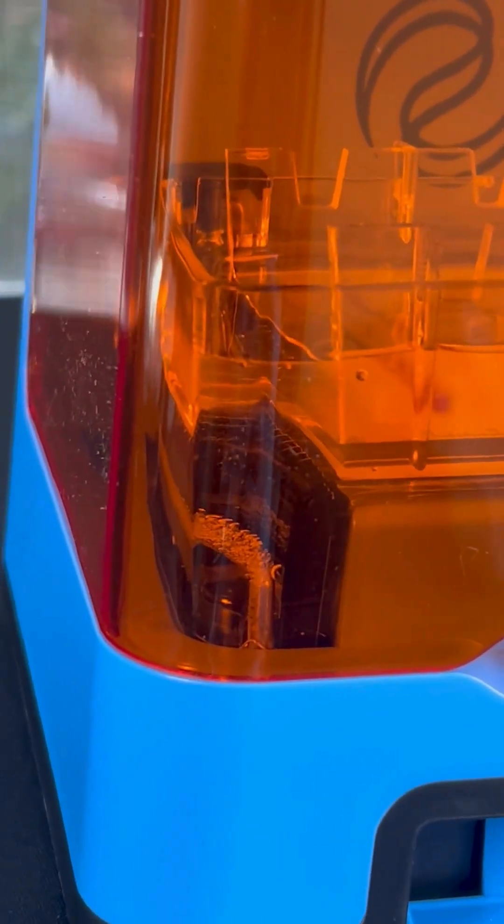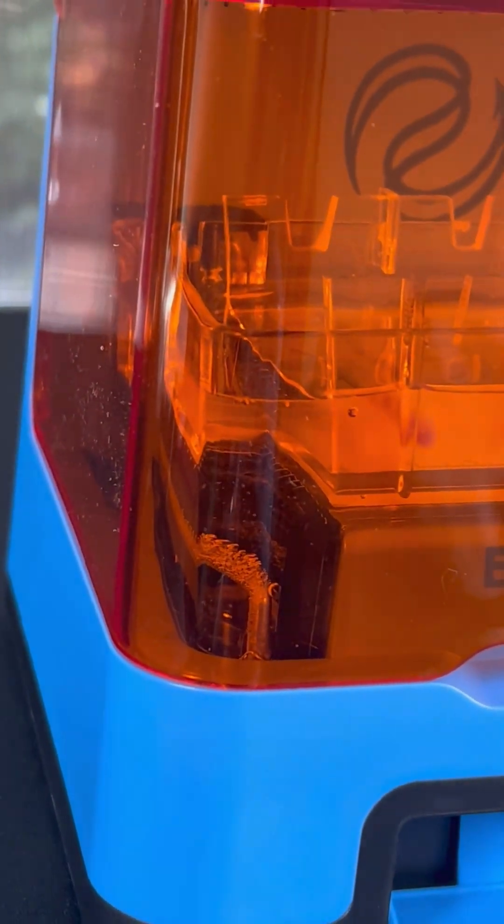You can see the bubbles of the current flowing through the gel right there. You can turn on the blue light underneath and see your DNA fragments begin to separate.